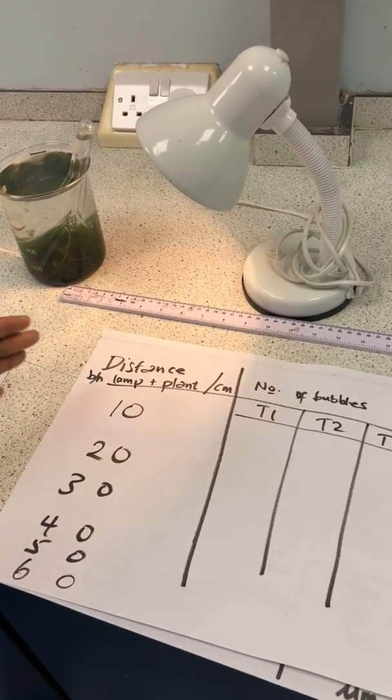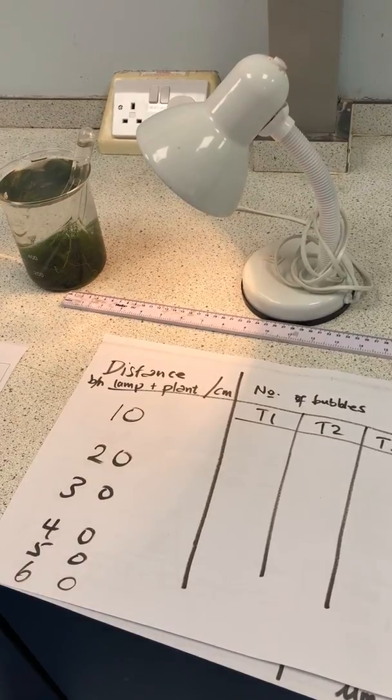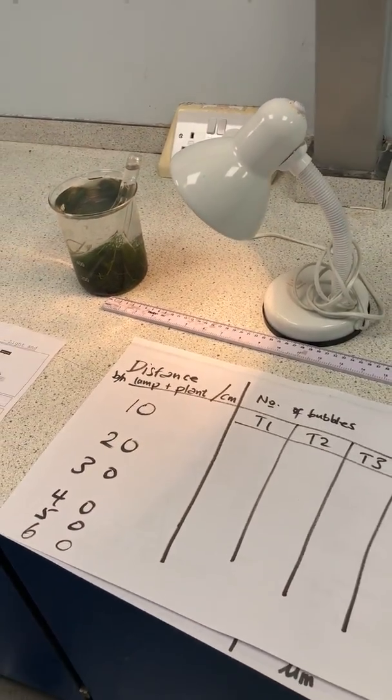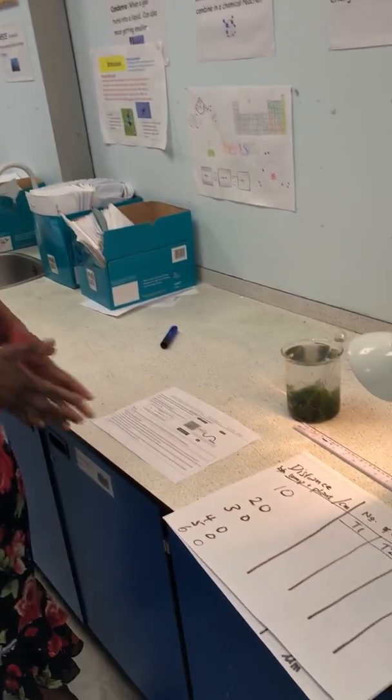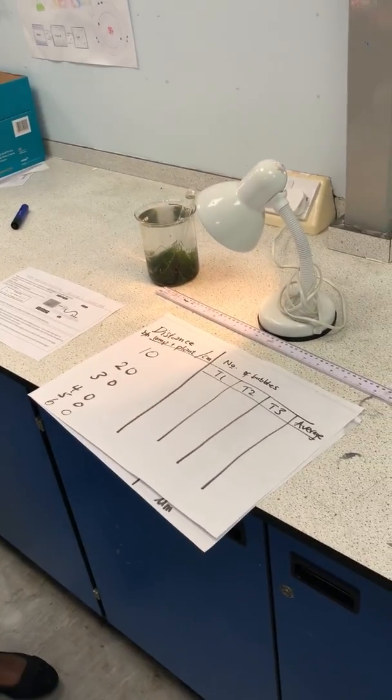That should enable us to plot a graph if we have all our results. Normally, the minimum number of points you should have for a graph is 5. So if we have 6, that should do. Based on this, we can then write a conclusion.